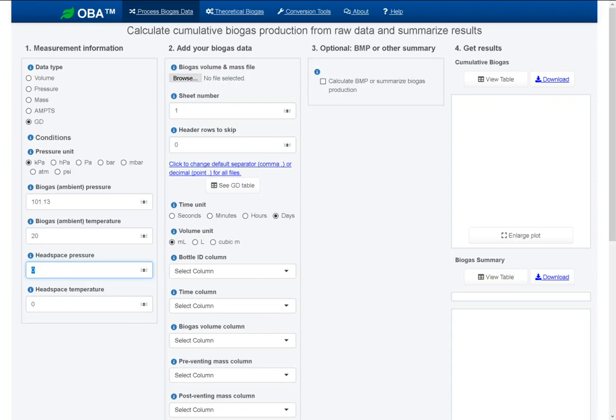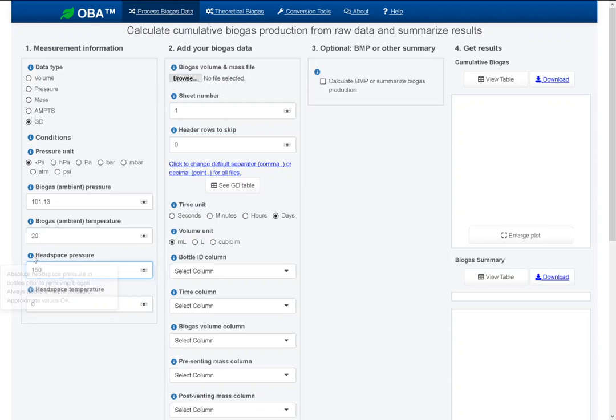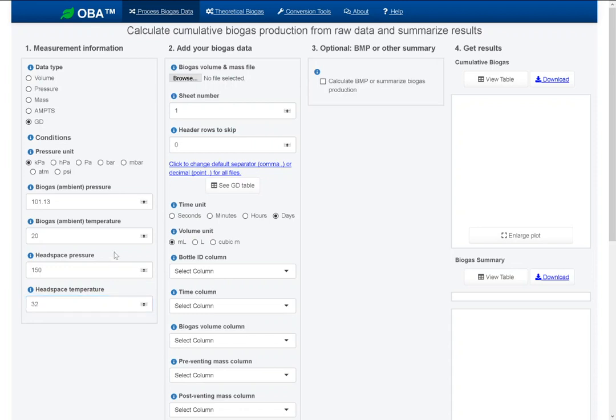Those values are going to be used for standardizing the biogas volume measurements. Now we need some information for the mass measurements, the gravimetric measurements. Headspace pressure, an approximate value, unlike the ambient pressure and ambient temperature, these next two values, headspace pressure and headspace temperature, do not have a large effect on the results. So an approximate value, this is absolute pressure, was somewhere around 150 kilopascals or 1.5 or so atmospheres. Headspace temperature was around 32. These bottles were incubated at 35 and they cool a little bit when they come out of the incubator.